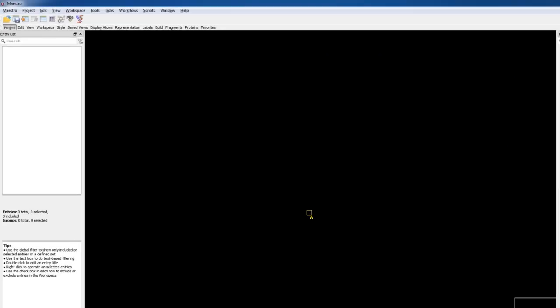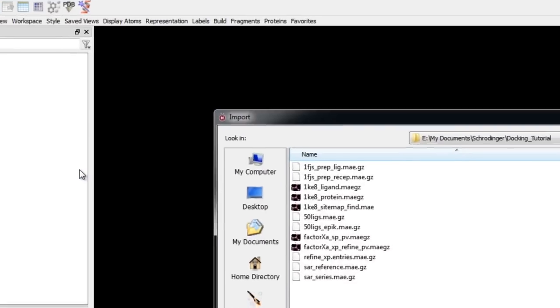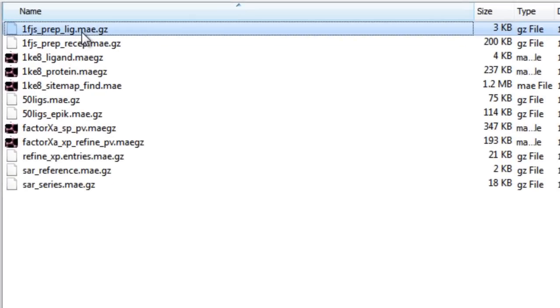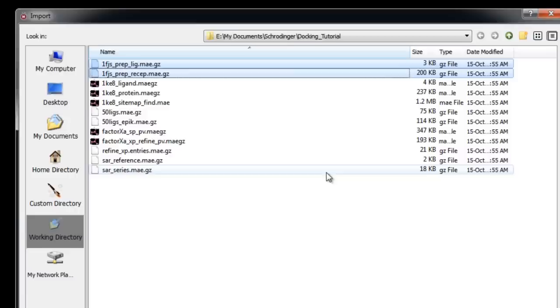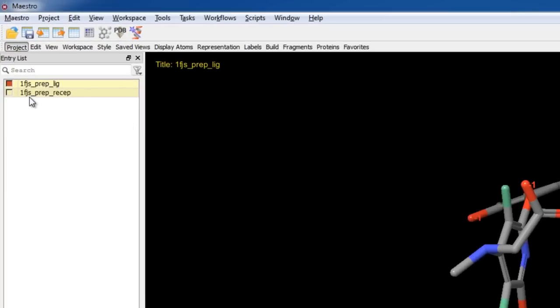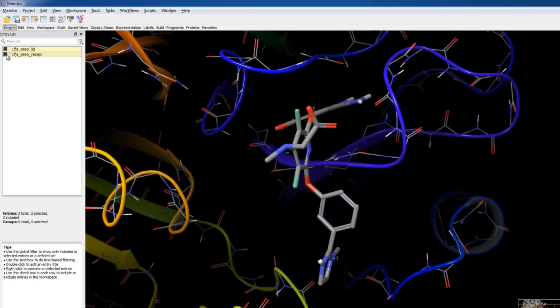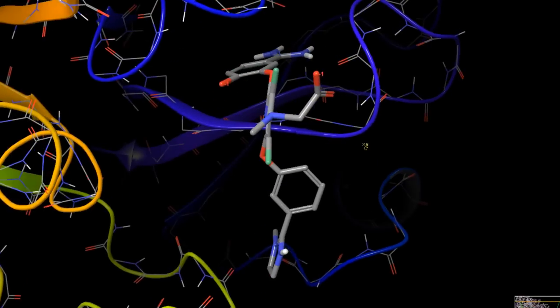Now let's import the complex, which consists of two files: one containing the receptor and one containing the ligand. Go to Project > Import Structures, then select one_fjs_prep_lig.mae.gz and one_fjs_prep_recept.mae.gz and click Open. Next, command- or control-click the other entry so that both ligand and receptor are shown on screen.